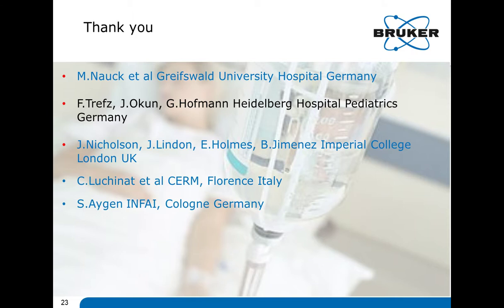Now, there was another question to your presentation, where it is asked if slide 18 is NMR based in your presentation. The answer is no. This was vitamin B12, and this was a classical clinical chemistry assay.